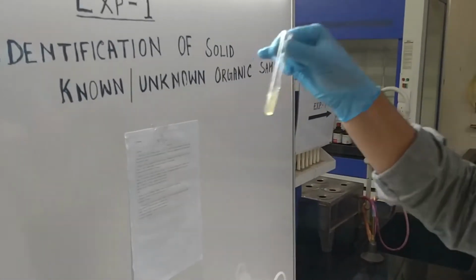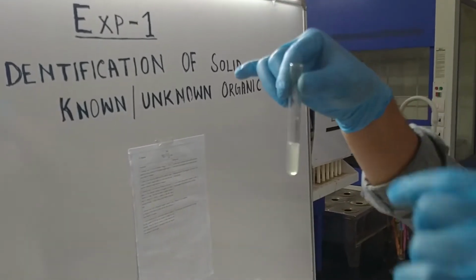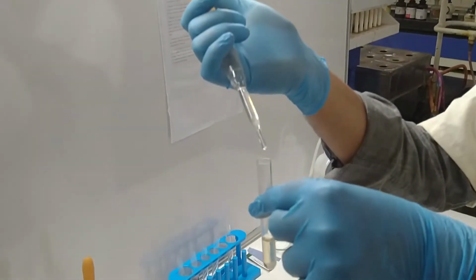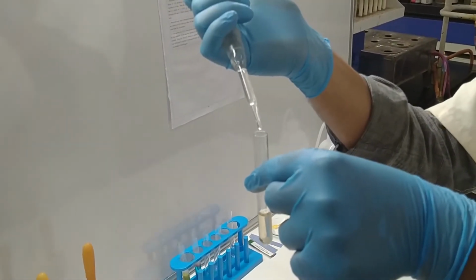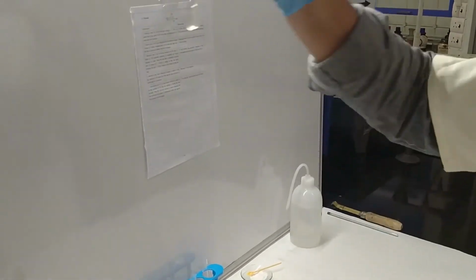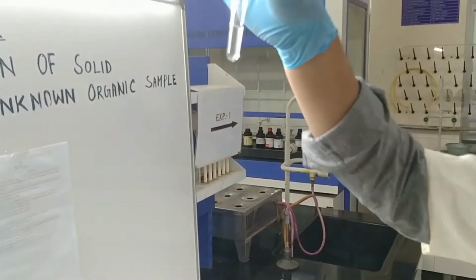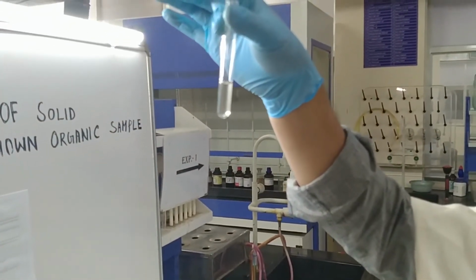Some of the parts are already dissolved. I think it consumed some drops more. Oops, I added. Now see, a colorless solution appears over here.